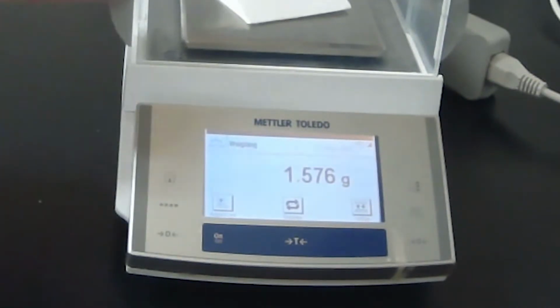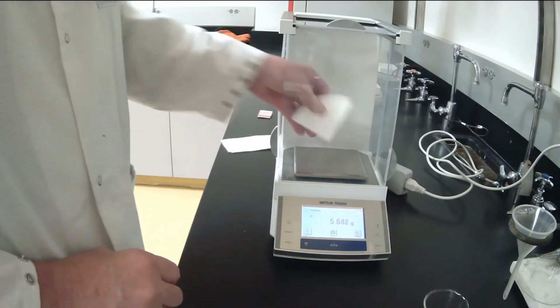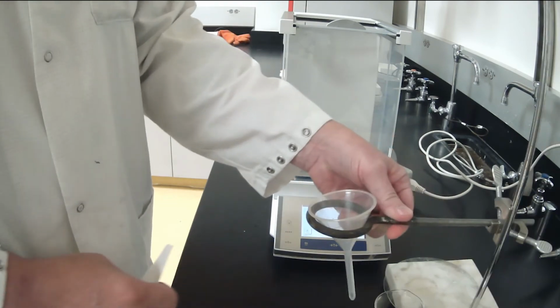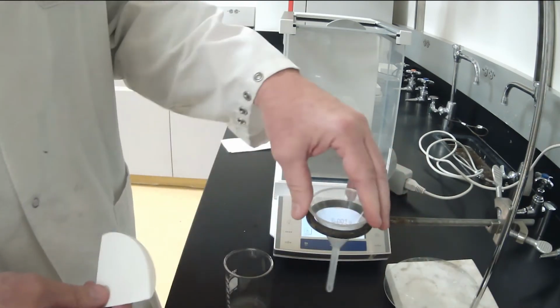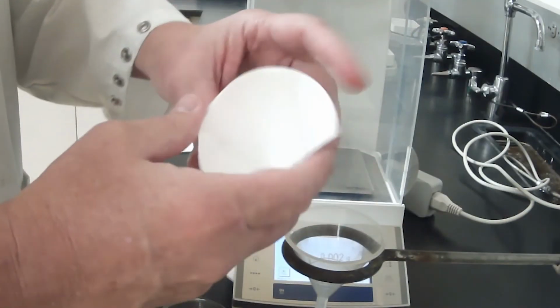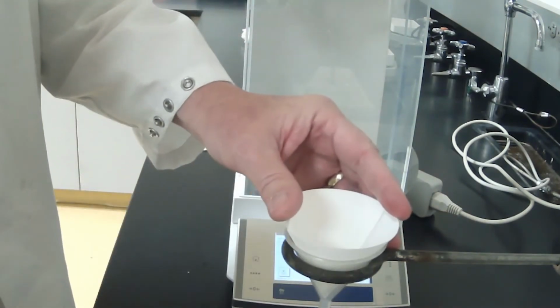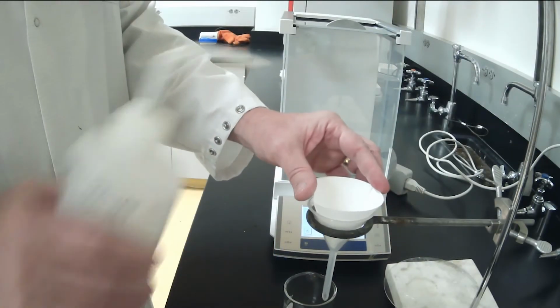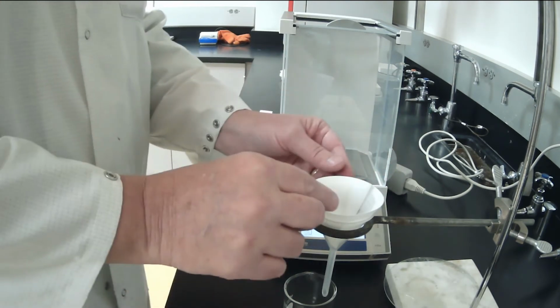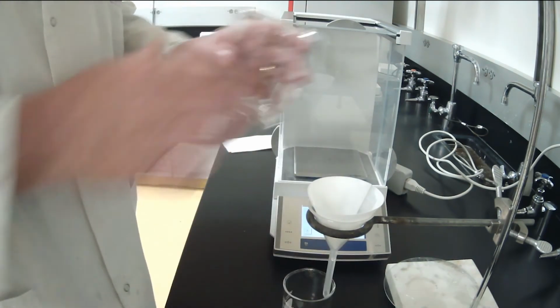Very good. Okay, now to set up our filtration. We're going to bring a funnel into view. Just a regular funnel, it can be glass or plastic. And if we peel the paper back, it makes this cone shape. And we're going to put the beaker that we weighed just a minute ago under it to capture the water. So I wetted the paper down with some ultra pure water to now filter this mixture.